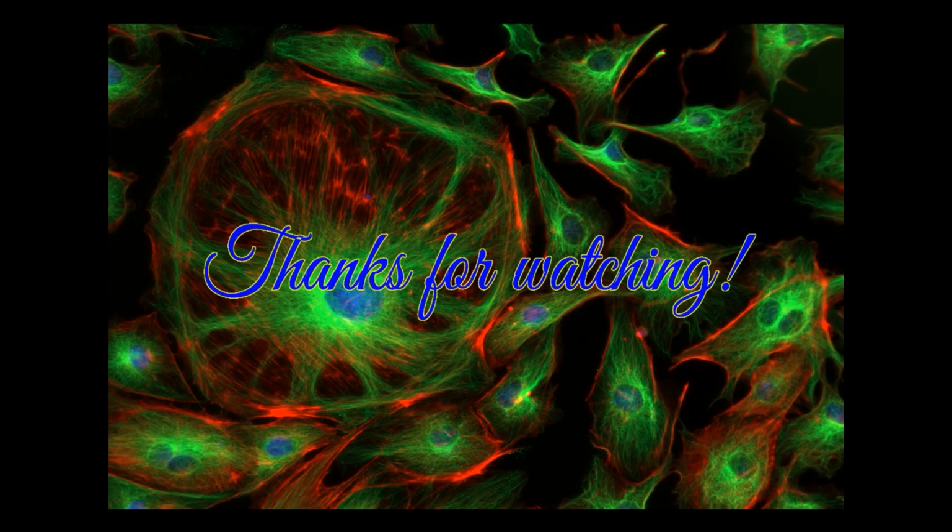This concludes our training video on image pre-processing. In this video, we walked through the setup process in our software and provided general guidance on setting the rolling ball. Ultimately, it is up to the user to determine the optimal settings for their specific sample types.